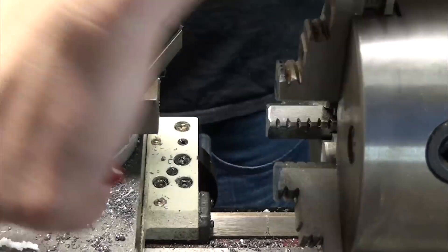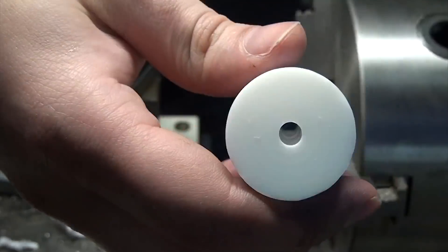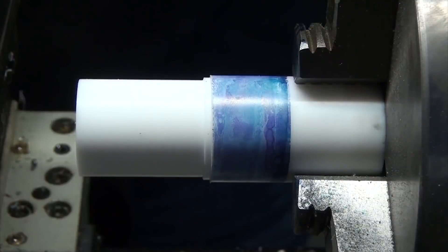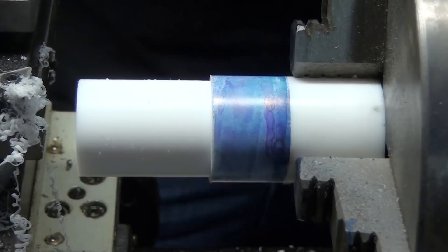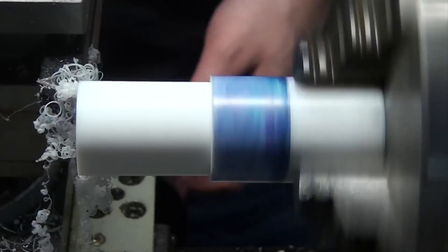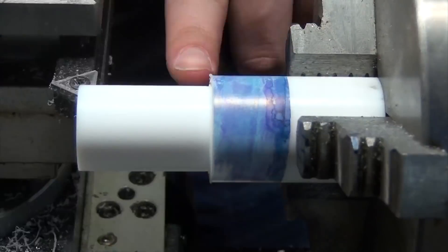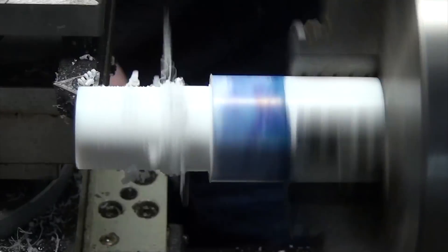I chose to work on the cone end first as I figured that was the bit I was most likely to screw up. I'd taken some measurements off of my glassware and figured out that I needed an angle of 2.8 degrees, but since it's not easy to set this on the lathe, I just eyeballed 2.5 degrees when I set the compound angle, and it seemed to work fine. It's hard to convey in this video how snug of a fit these parts turned out to be in the end, so precision here really isn't super crucial.